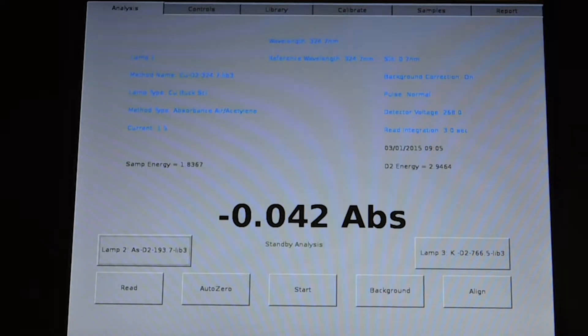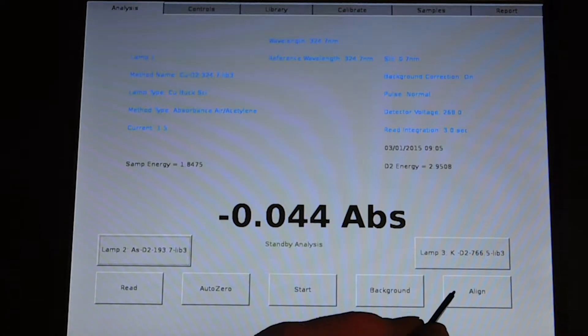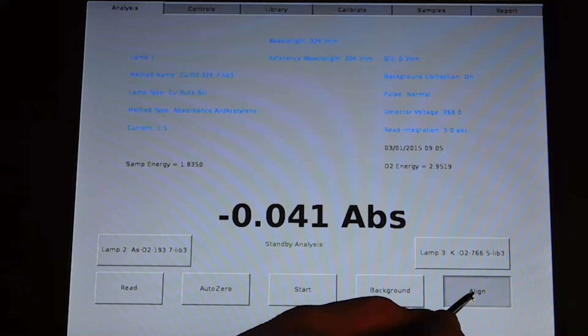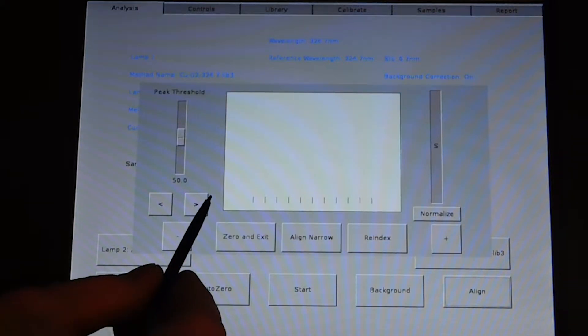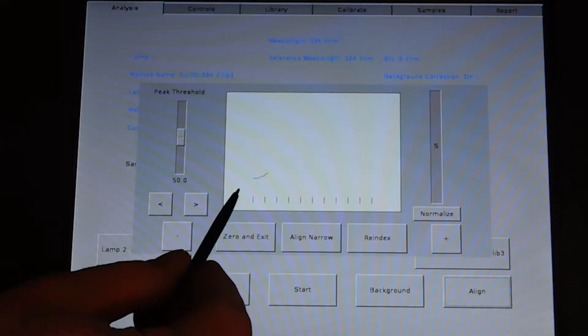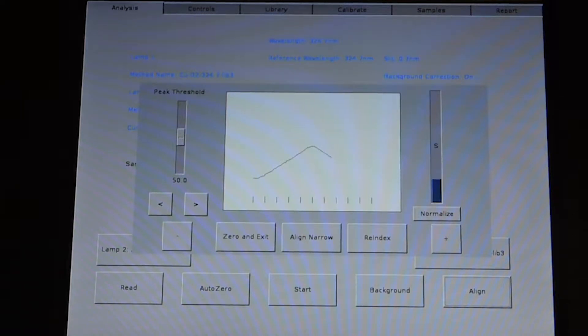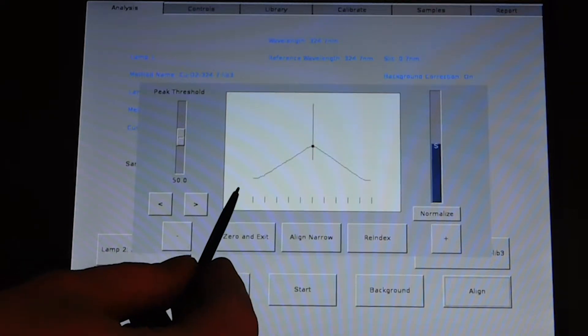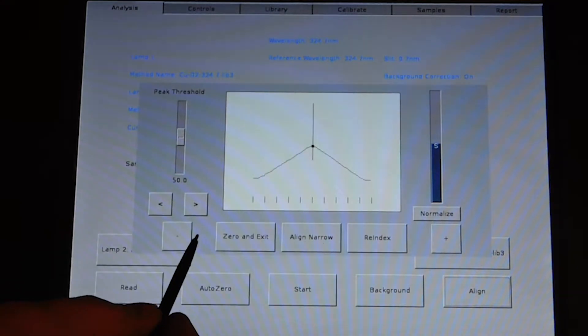Then you need to align the instrument on the proper wavelength by simply pressing the align and waiting for the trace to be completed. It will show one or more peaks and it will pick the high point of the peak.